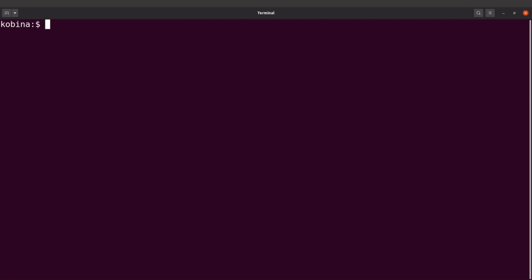I am in the terminal now. This is my command line. What I'll do first is to create a directory and then cd into it. That will be my working directory. So I'll say mkdir, let's say FST, and then I'll cd into it. Perfect. So now I'm going to download the VCF file.